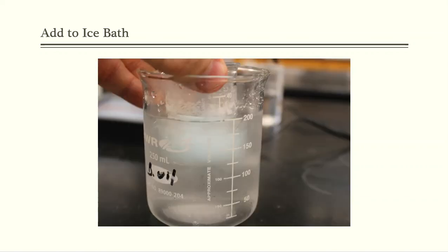So now that it's cooled to room temp, or give or take, I can at least hold it with my hand and not be burned. I'm now going to transfer that into an ice water bath. So I'm holding it up here at the very top. This ice water bath is going to cool that solution even faster and get it even colder than room temperature. And that's what we need for a good enough recrystallization technique here.